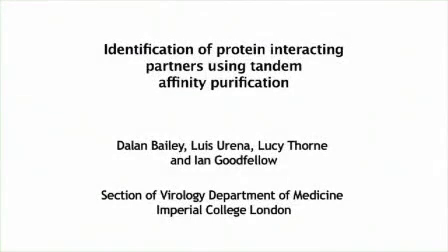The overall goal of this procedure is to use a method known as Tandem Affinity Purification to isolate protein binding partners.